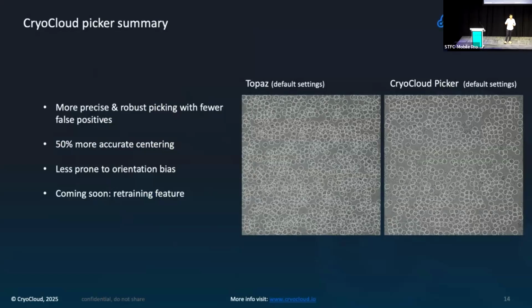have many users who really challenge us with difficult data sets, and there sometimes the threshold really needs to be adjusted. So the retraining feature will really help with that a lot, where we then can retrain across many different data sets for specific targets.